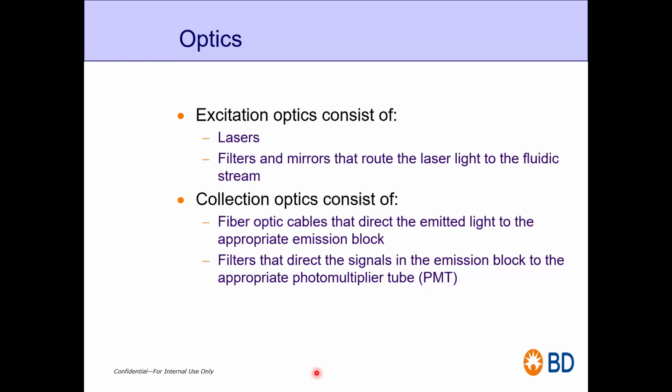Singh has said laser is a coherent source. Okay, I apologize to ask you this, but Neha, can you please open your mic and tell me what this coherent source means? It's a great answer. I was expecting this.